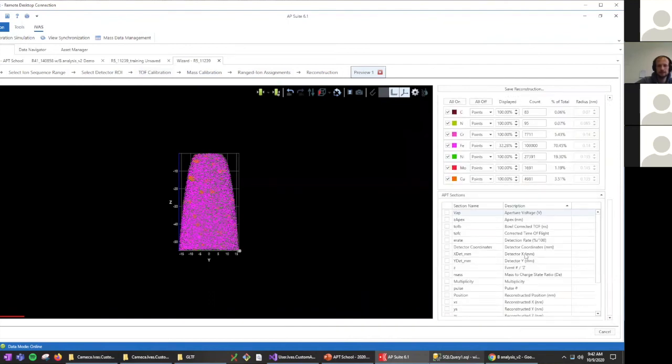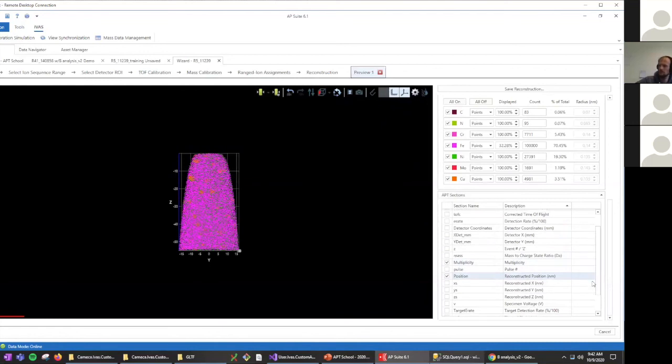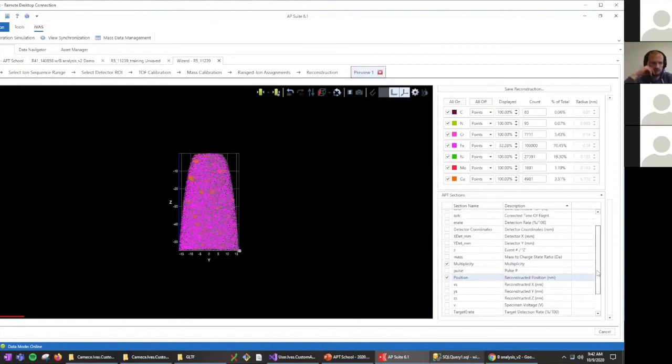And with the APT file format, which contains a lot of data, it would be nice if you could provide a reference implementation for a Python and a MATLAB loader, to load it into NumPy and to load it into MATLAB. That would be something very nice. Maybe I can help you with that, at least on the MATLAB side. Apart from that, I think you've made quite a few steps in the absolutely right direction.